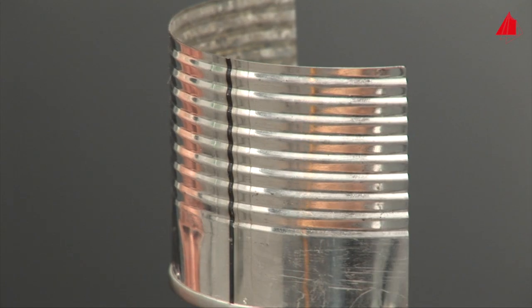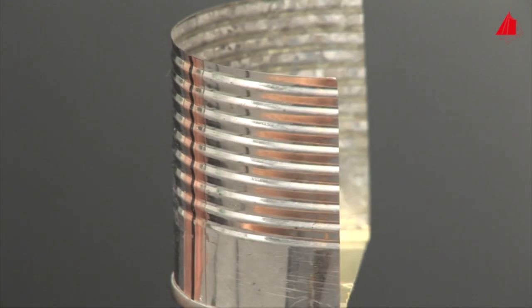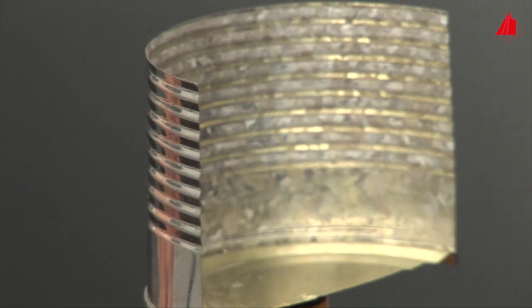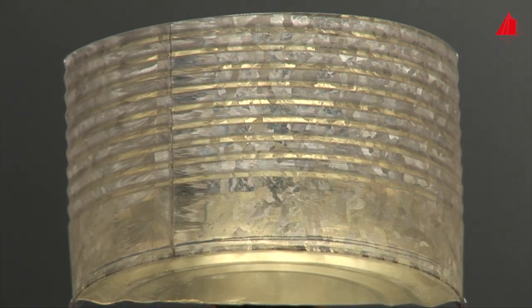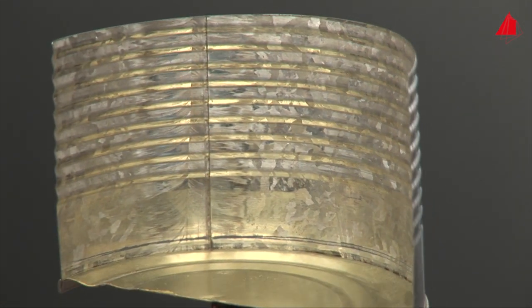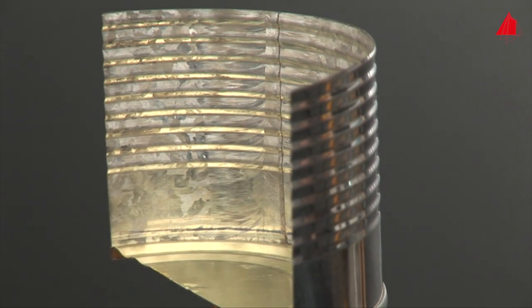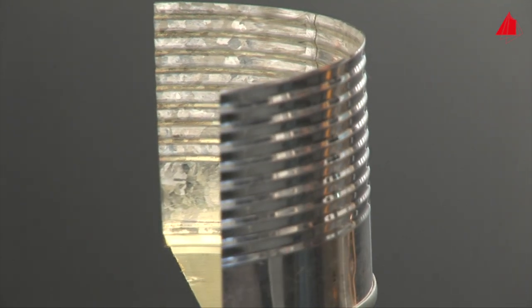Even inside of a tin plate steel can, crystals are visible. The fruit acid of pineapples has etched the flat crystals of the tin coating. A natural and unintentional grain contrast etching process has taken place. On the outside, the tin coating is still unchanged and shines like new.